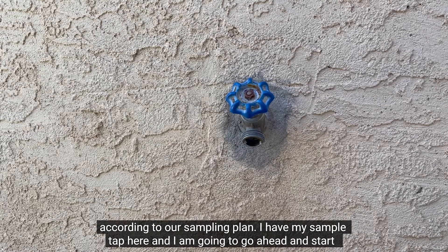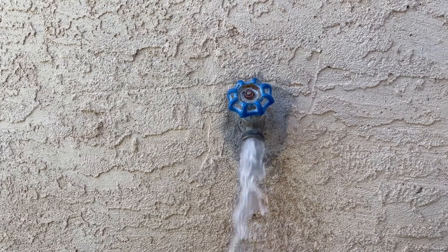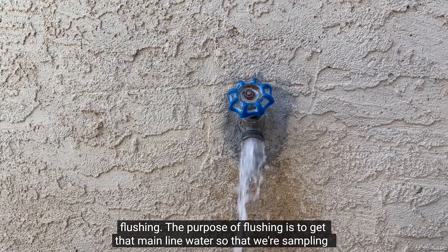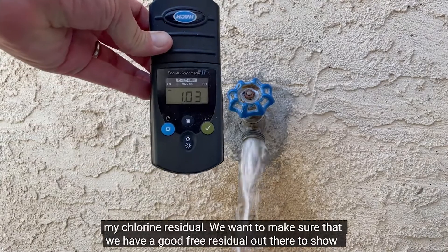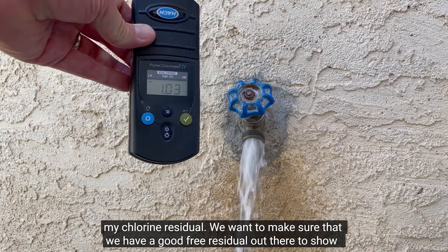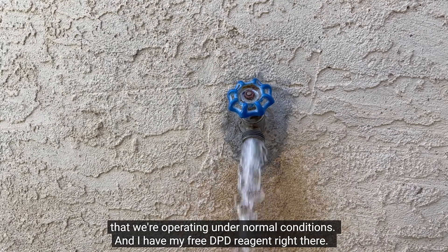I have my sample tap here, and I'm going to go ahead and start flushing. The purpose of flushing is to get that main line water so that we're sampling what's out in the main line. I'm also going to remember to take my chlorine residual. We want to make sure that we have a good pre-residual out there to show that we're operating under normal conditions, and I have my pre-DPD reagent right there.